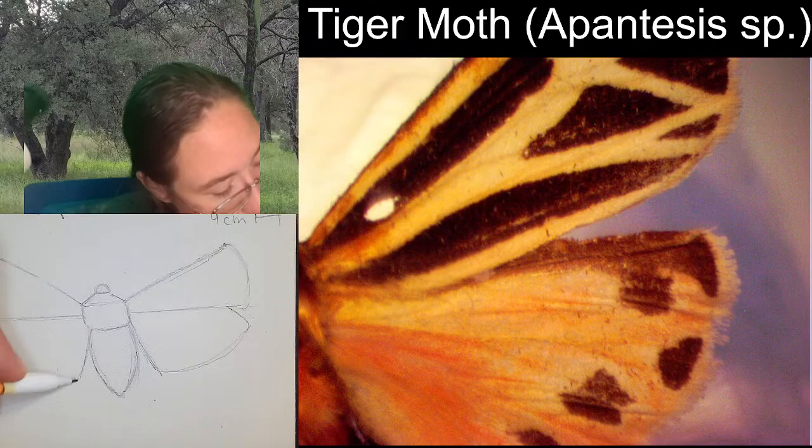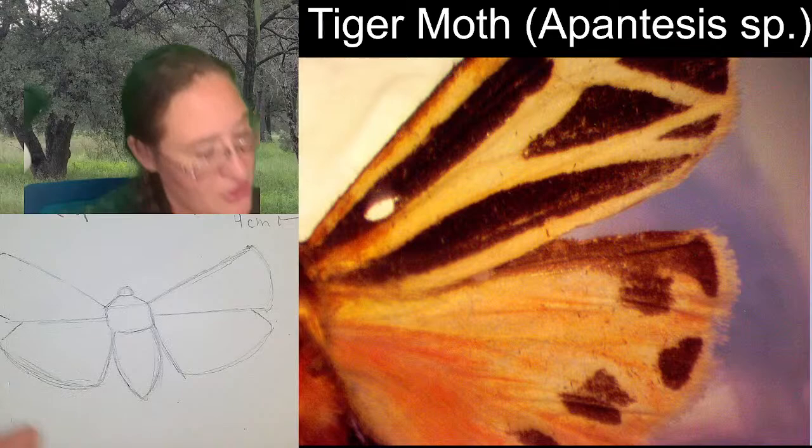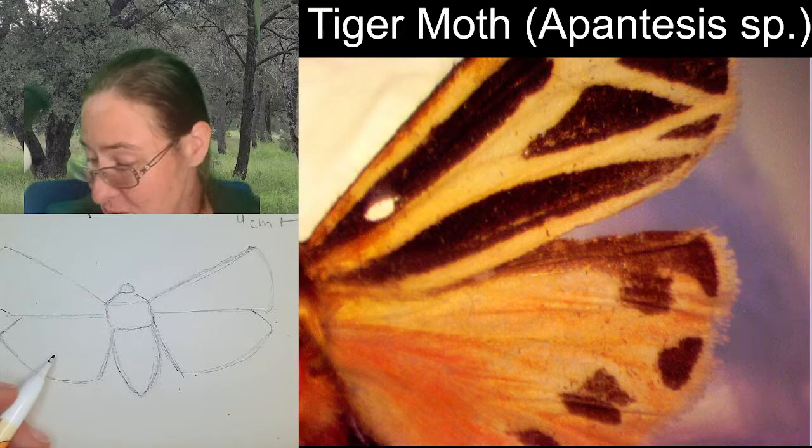And then we're just going to go ahead and double that up to make sure that your specimen is mostly symmetrical. That's the goal, because insects do get to be symmetrical. And even though the spots on the hind wing vary specimen to specimen, generally they are very, very similar, the left to the right.